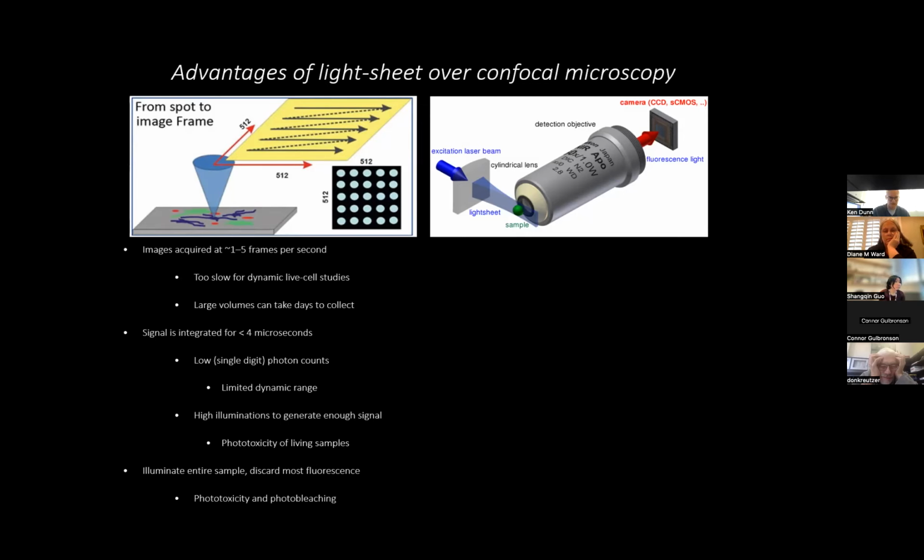That's too slow for a lot of dynamic cell studies. And if you were collecting large volumes, and that's a lot of what I'll be talking about today, it can take literally days to collect large volumes of things like images of the entire brain or something like that.